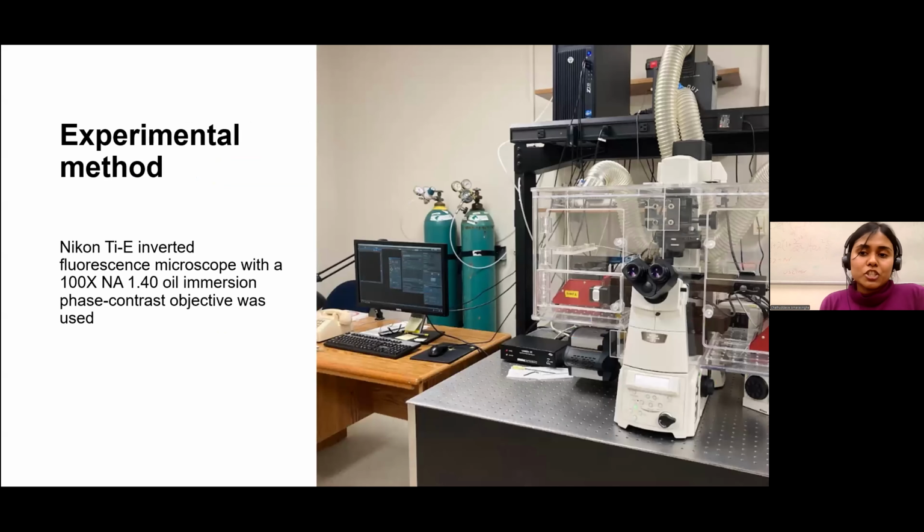And then we image E. coli cells using our Nikon TI inverted fluorescence microscope. We also use a motorized stage that allows us to take time-lapse images of cells in a bunch of different positions on the microfluidic device. And this method allows us to image thousands of cells, providing us statistically robust results.